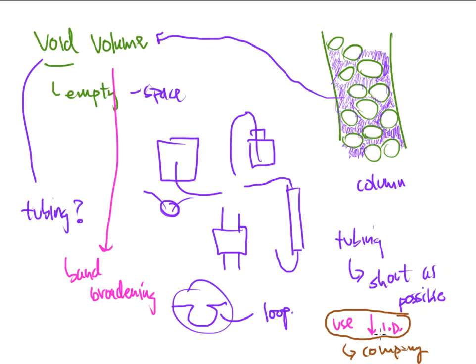When you go through and you start looking at replacing some of the tubing, you want to make sure that you give them the proper item number, because not all tubing is made the same way. And if you've got questions, tell the representative at the company what area this tubing was pulled from. That will give them a better idea if you're telling them the right item number or not. So tubing can be different, just like anything else, especially on a liquid chromatograph system. The material is going to be different. The IDs are going to be different. The pre-measured length of the tubing is going to be different. It's going to be all over the place. So just keep that in mind when you order these replacement parts and you do some maintenance on the instrument.